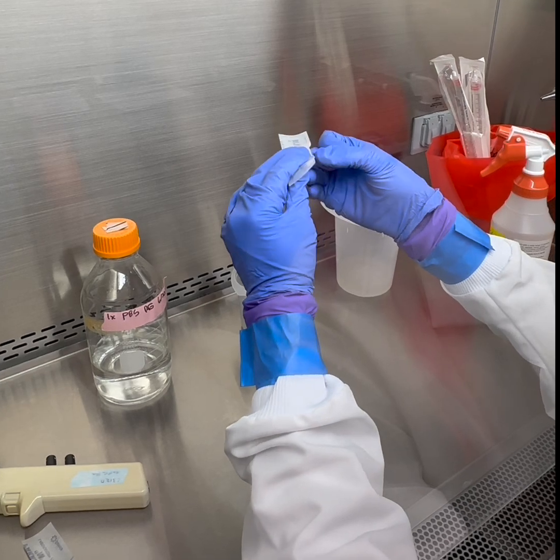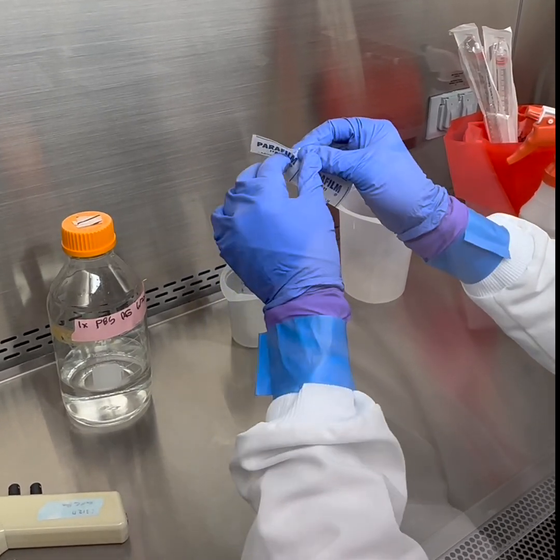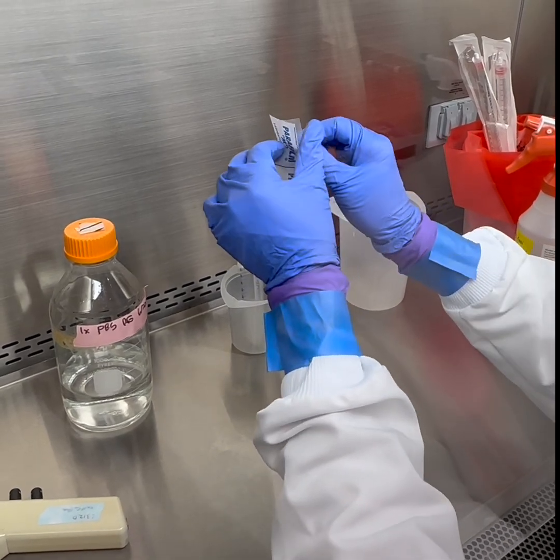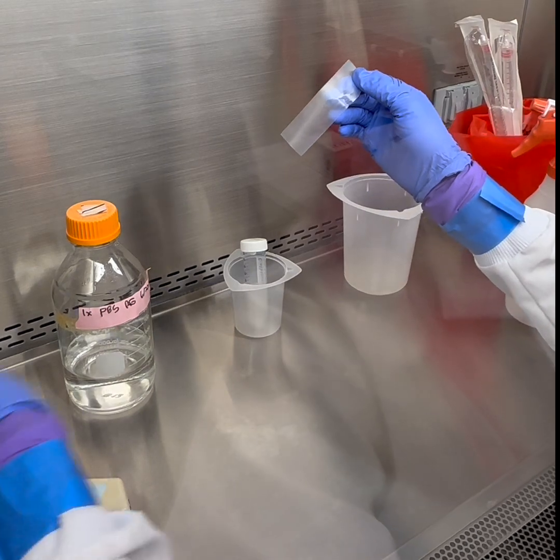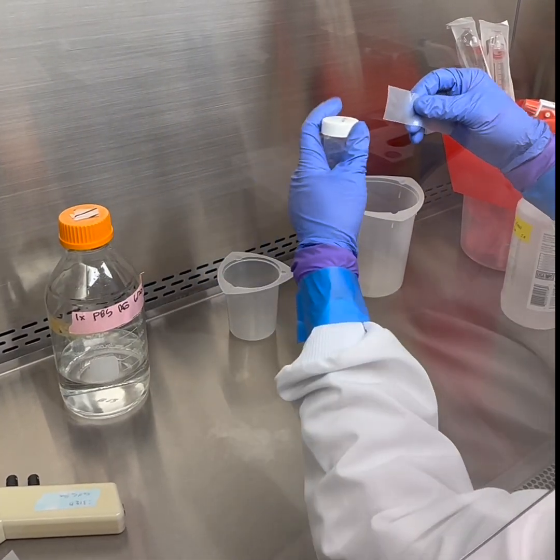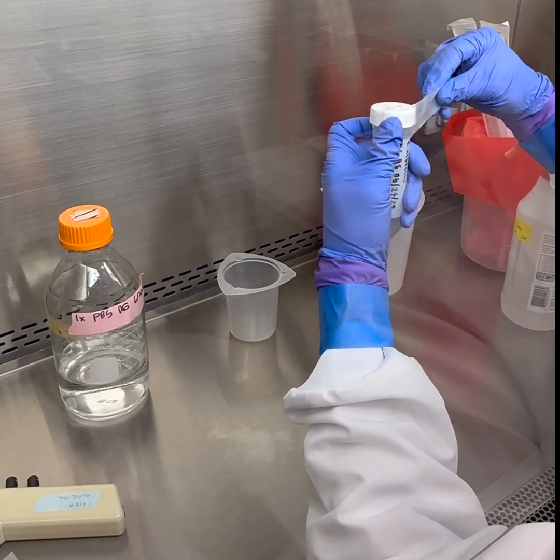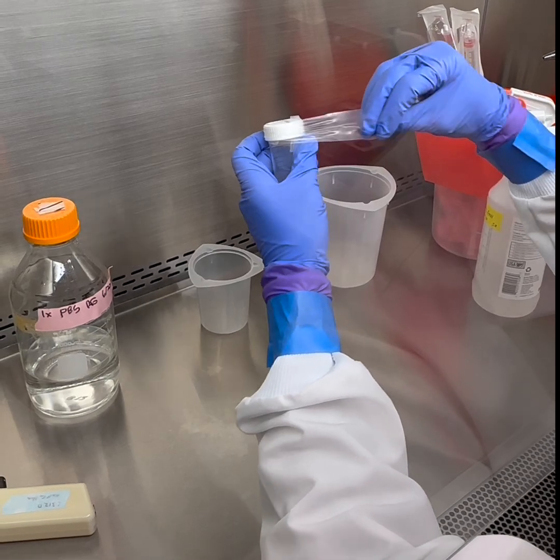We're not using airtight rotors for this, primarily because there's not really a respiratory risk, and so we just have a protocol in case there's a spill inside the centrifuge on how to contain that. All right, you can just stretch it around, seal it.